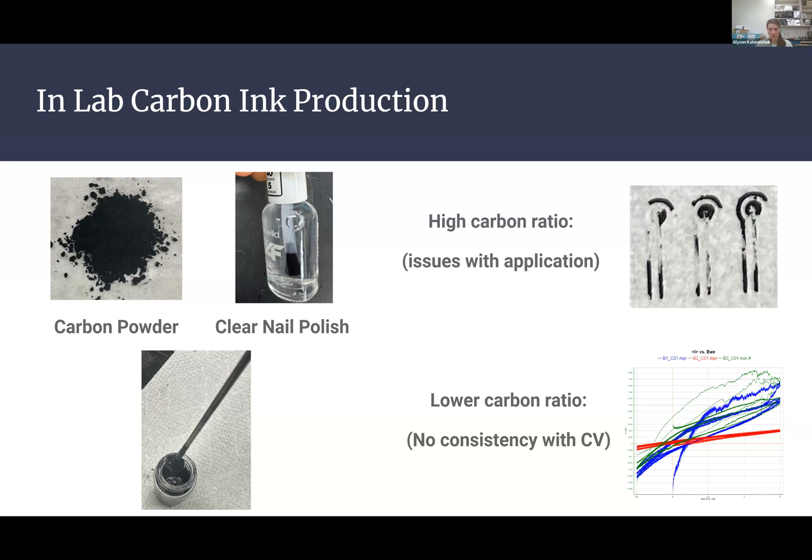I'll spoil it — the homemade ink didn't work that well. It's something we want to consider in the future, but for the time being we decided to move forward with the already purchased ink, as it was more consistent and had fewer obstacles. As you can see in the top right, with the higher carbon ratio they suggested, there were a lot of issues with application — it was flaking off and not adhering properly to the PET. We considered lower ratios, but testing showed there was no consistency between electrodes whatsoever.